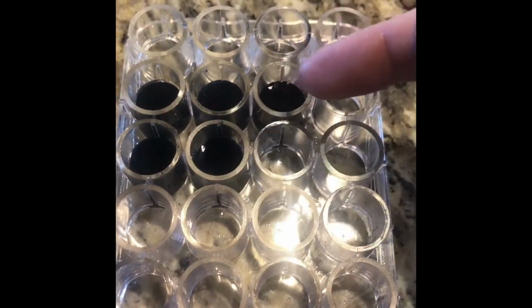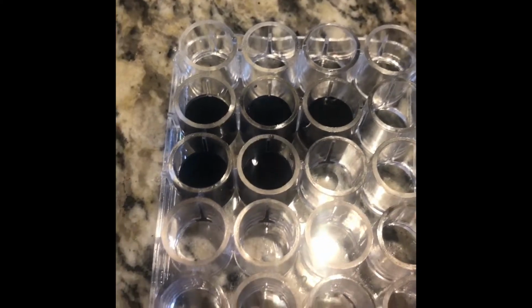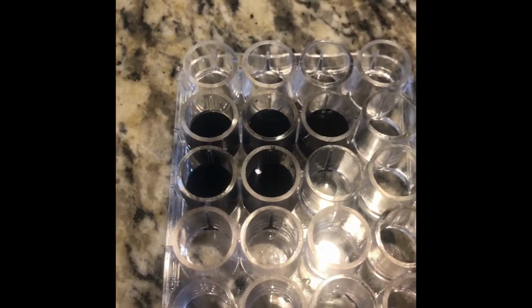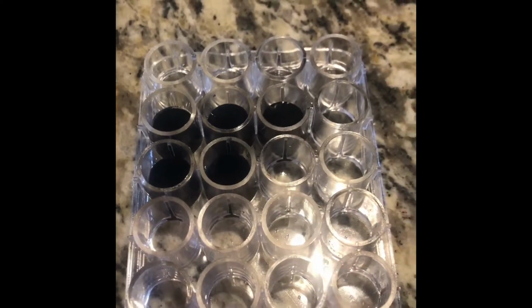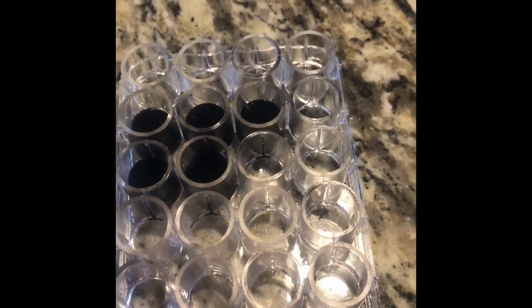So, as we increase the amount of copper sulfate in the wells, what happened was there was a quicker reaction rate. And what we can see by that is that copper sulfate is obviously a catalyst to the reaction. It lowers the activation energy of the overall reaction, and then it allows it to take place quicker. So with the increase of concentration of copper sulfate, which is the catalyst, reaction rate increases.